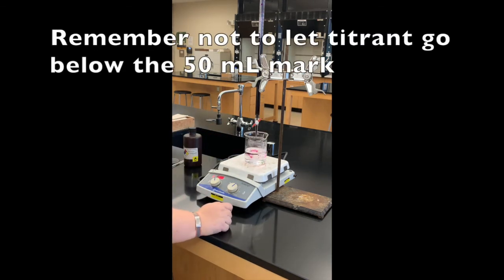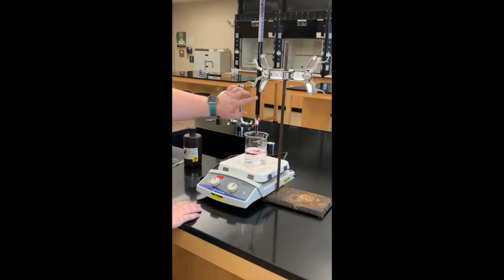I do want to pay close attention to how low my potassium permanganate is getting in the burette, in case I can't finish this trial with the amount remaining. If it's getting close to the 50 mL line I will stop and refill it, but hopefully that doesn't happen. Just make sure you keep a careful eye on that.